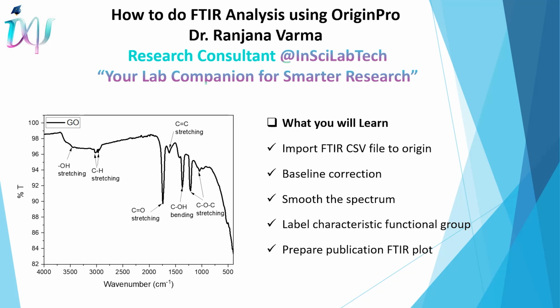As part of our For Researchers by Researchers initiative, I'm here to show you how to do FTIR analysis of graphene oxide using OriginPro. In this tutorial, we will start with the raw FTIR data of graphene oxide, clean the baseline, smooth the spectrum, identify and label the characteristic functional groups, and finally prepare the publication-ready plots. Let's begin by importing the FTIR data.